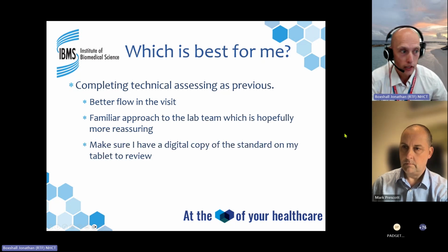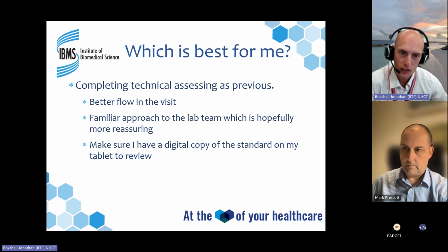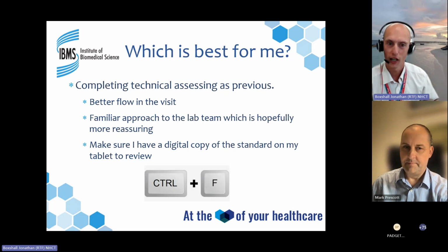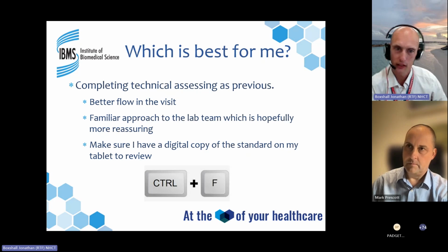For me, though, the key is that I was graciously given a digital copy of the standard from UKAS as part of my technical assessing, and that is amazing. I have it on a tablet which I take technical assessing, and our good old friend Control F saves me a lot of time. If we're not sure, I can Control F and find the phrase I'm looking for, and it saves a lot of time in the technical assessment, because ultimately time is one of the key challenges when we're out technical assessing.